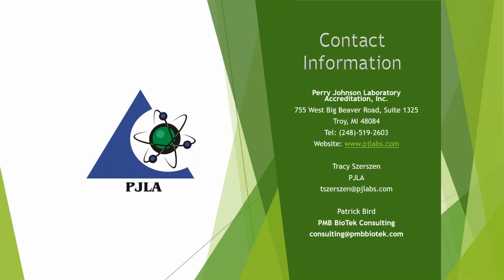So each one of those steps is a potential issue for error. So having an analyst that is skilled enough to work with very small volumes and understands where the pitfalls of those technologies can come about would be where I would say to troubleshoot there. And I know that's a very diverse set of things to look at. It really depends on the technology you want to adopt.